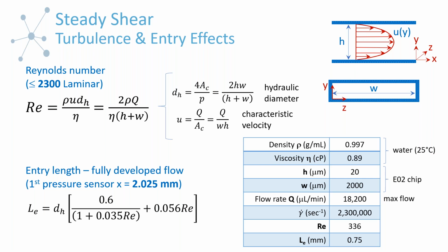But once the Reynolds number gets larger and larger, which is going to come from a ramp up in, say, volumetric flow rate, then you can see this transition. The value varies a bit, but somewhere around 2300, 2500, something like that is where you go from laminar to turbulent, where you have secondary flows or eddy currents.